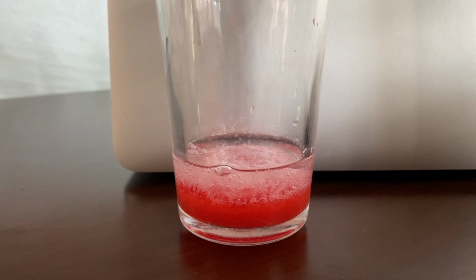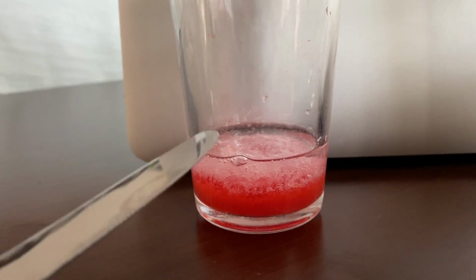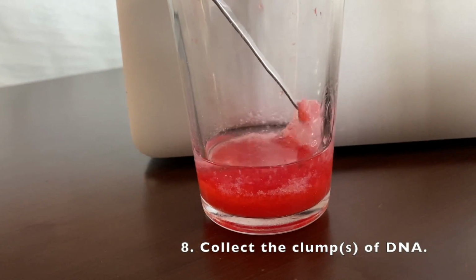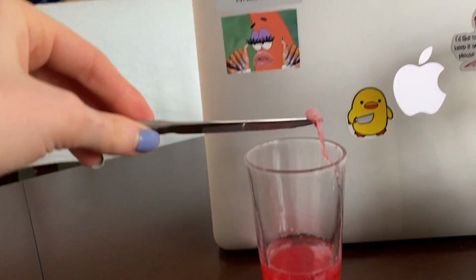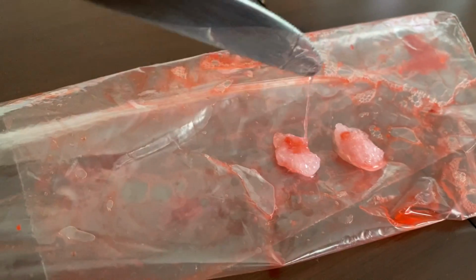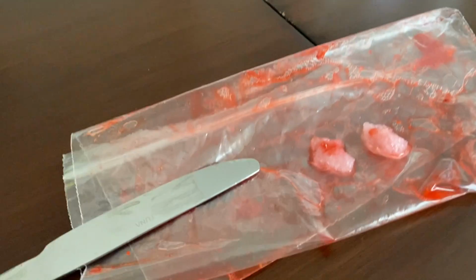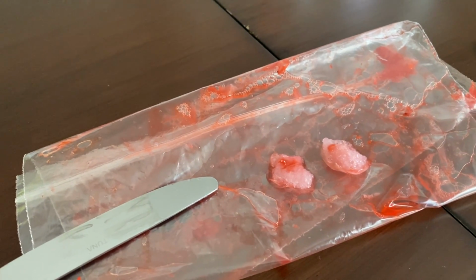The DNA is now extracted. These bubbly white looking things are the DNA, and we can take it out with our knife. It's really interesting because we can actually see and touch the DNA of a strawberry without even using a microscope.